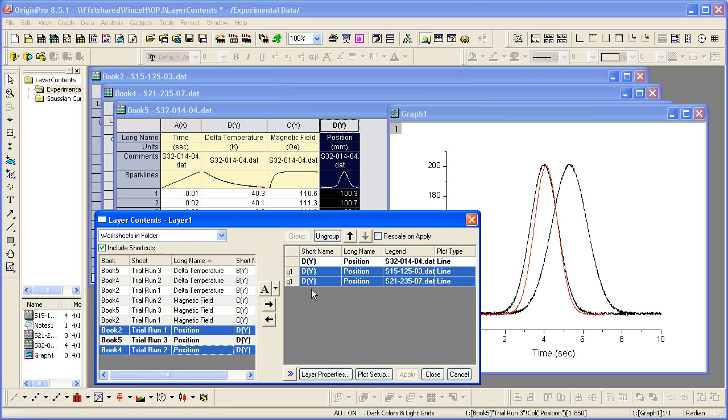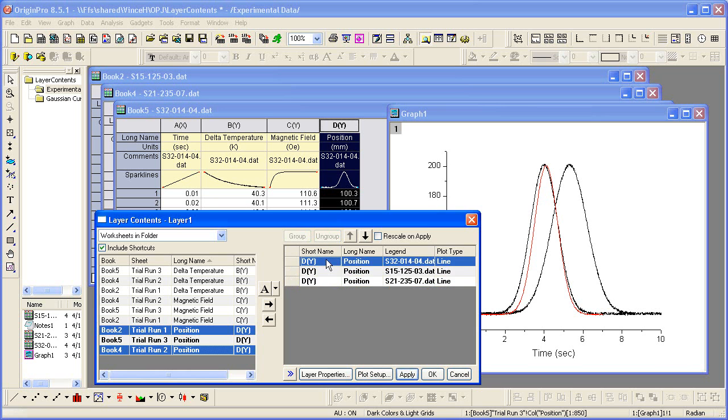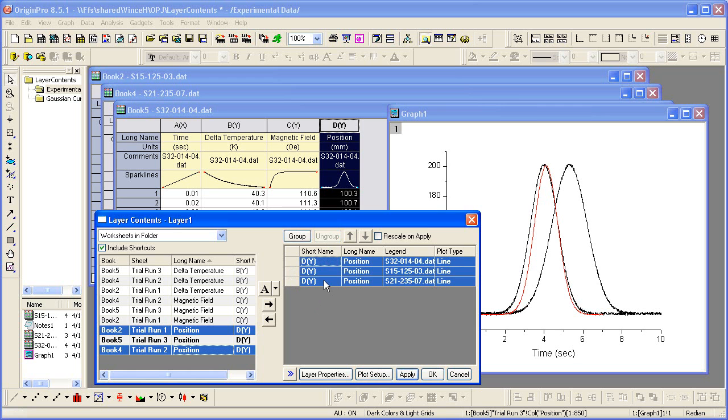I brought those two datasets over together, and so they came in by default as a group. If I want to group all of the datasets that are now plotted together as one group, I can ungroup the existing, then select all my datasets and regroup. Clicking Apply shows that the new group has been applied, because now the three plots have different colors.